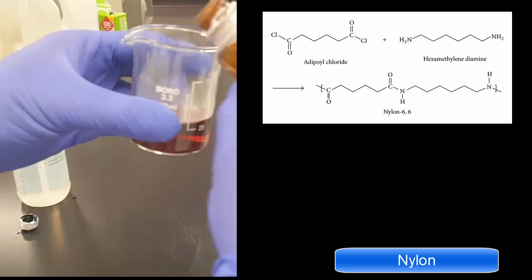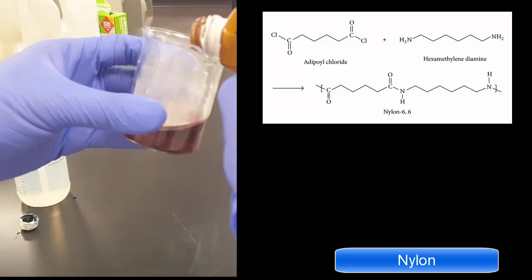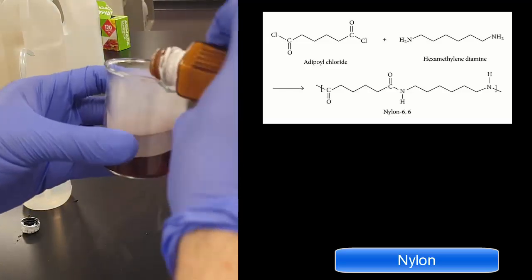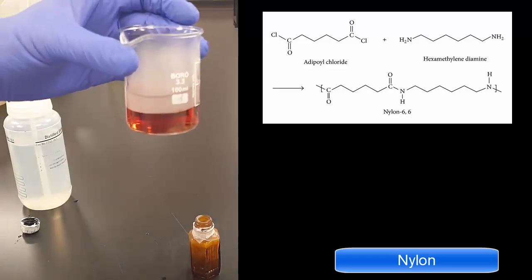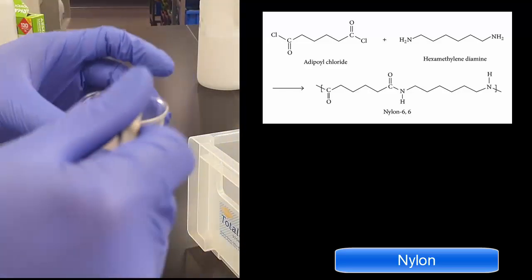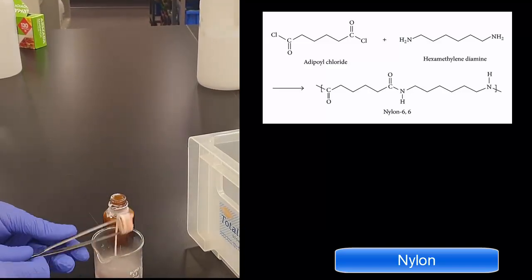And I accidentally spelt a little tiny bit of that. And so what happens is one's more dense than the other, so it layers on top. So the reaction is actually in between the two layers. And so what you can get is you pull it out and you just keep rolling it on. I eventually give up before I end up using it all because it just goes on and on forever.